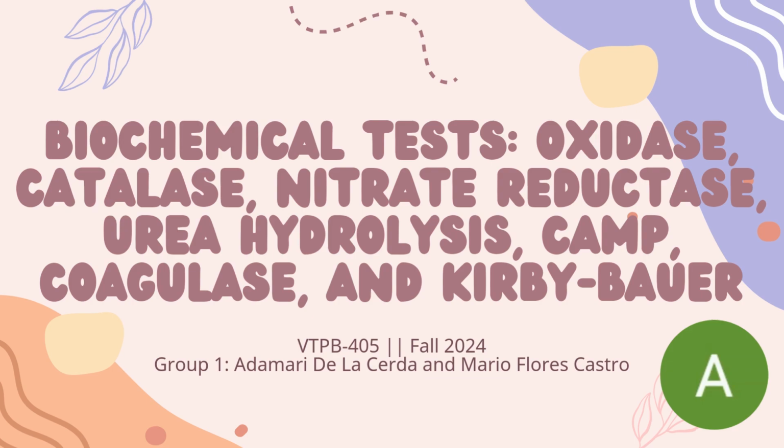Howdy, my name is Adamari Cerda, and my partner Mario Flores Castro and I will be discussing our experimental lab report on the biochemical tests that include oxidase, catalase, nitrate reductase, urea hydrolysis, CAMP, coagulase, and the Kirby Bauer experiments.